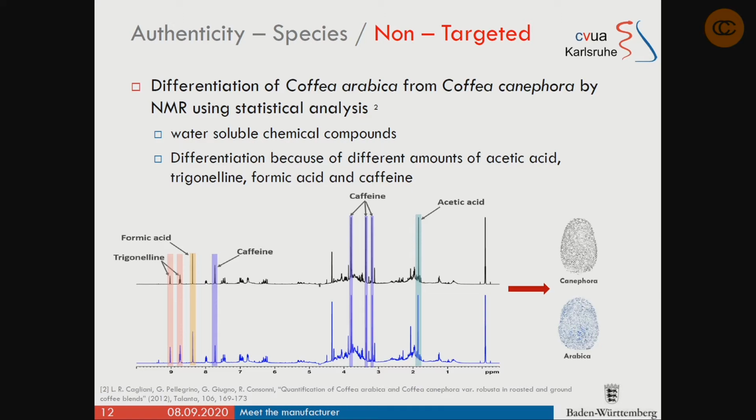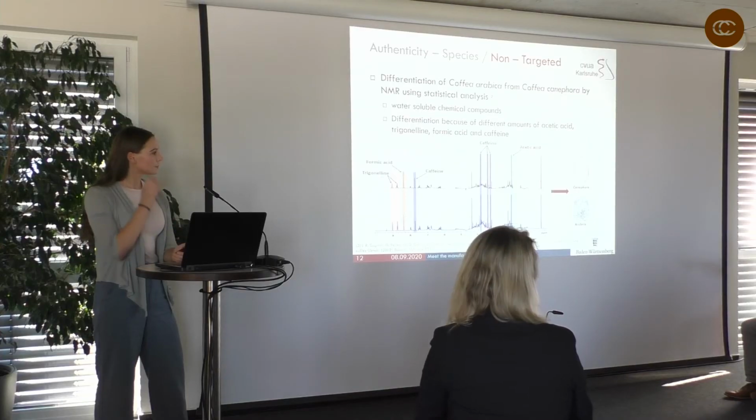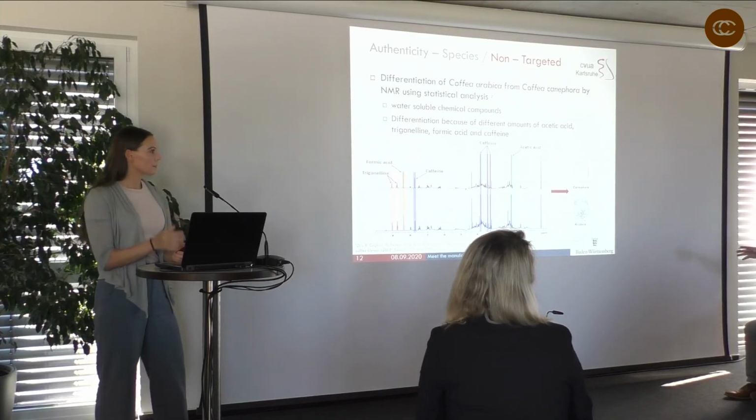And the problem is also that NMR has a linear range of like 10,000 or more. So if you zoom in, you begin to see like 10,000 of very, very small peaks, and there the differences start to become evident. So with the human eye, it's almost impossible to differentiate the spectra. But if you get this into a computer software, it will find the nuances and show them to us.